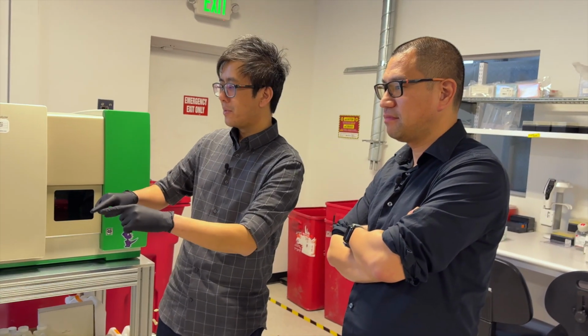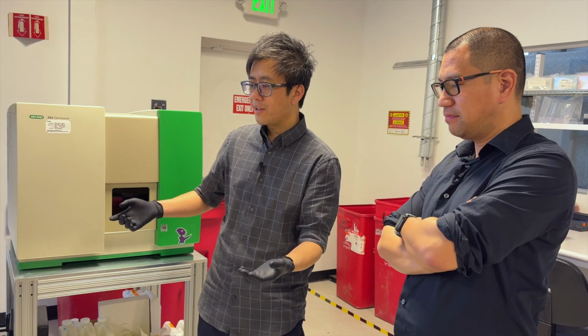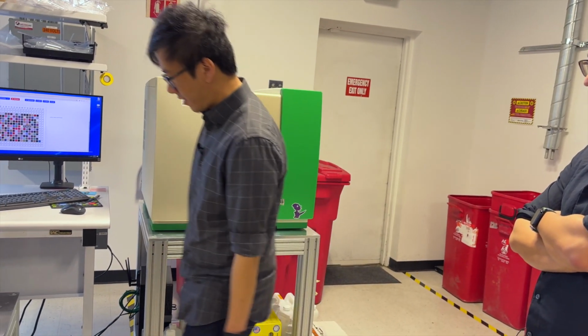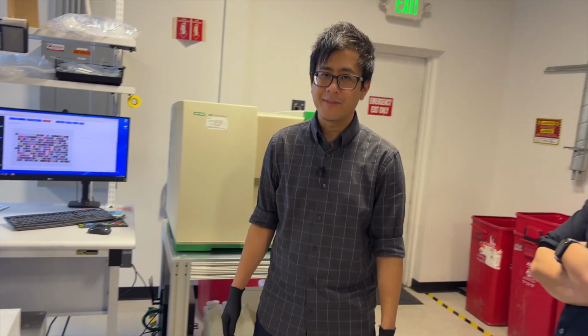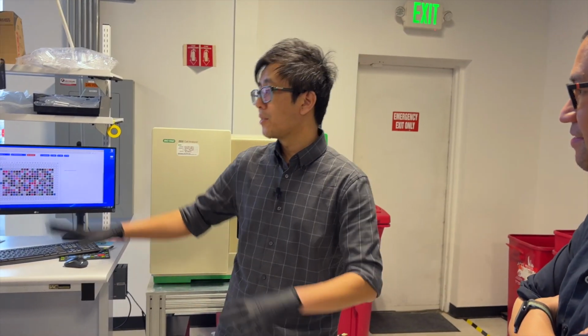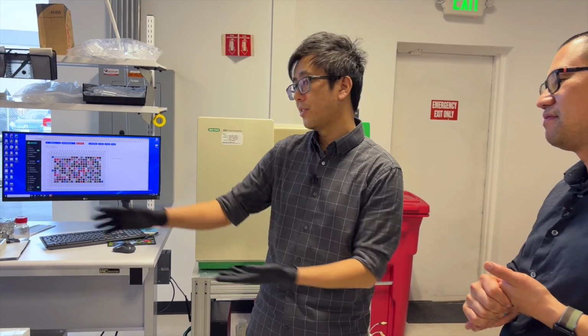It's pretty tough to see, but these tables are pretty heavy. They're all bracketed to each other. I have pretty strong confidence I can just come right here and kick this while it's moving, and everything will be fine. That said, you never know when things will change, and that's why, just like you always run test suites in software, you're going to have test suites on hardware too to make sure nothing has drifted.